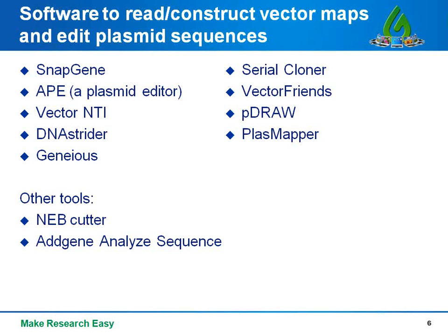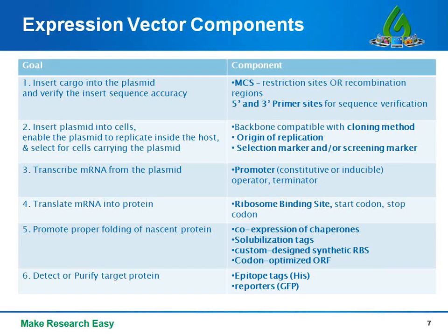So now let's dive in and think about all the things you want your plasmid to be able to do and what components it needs to contain in order to achieve those goals. I know this looks like a very busy slide. I've organized this to serve as a reference that you can come back to.